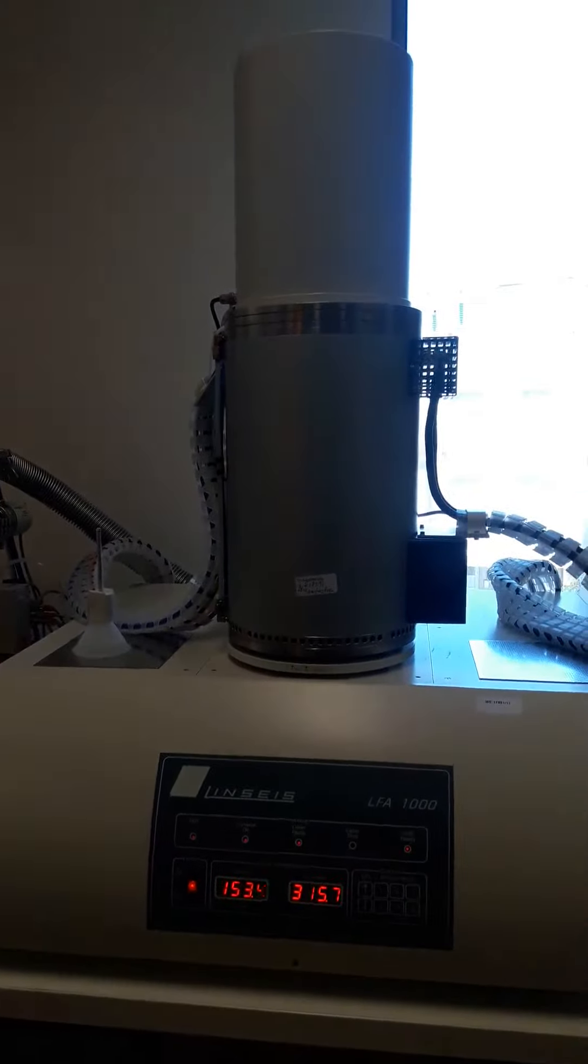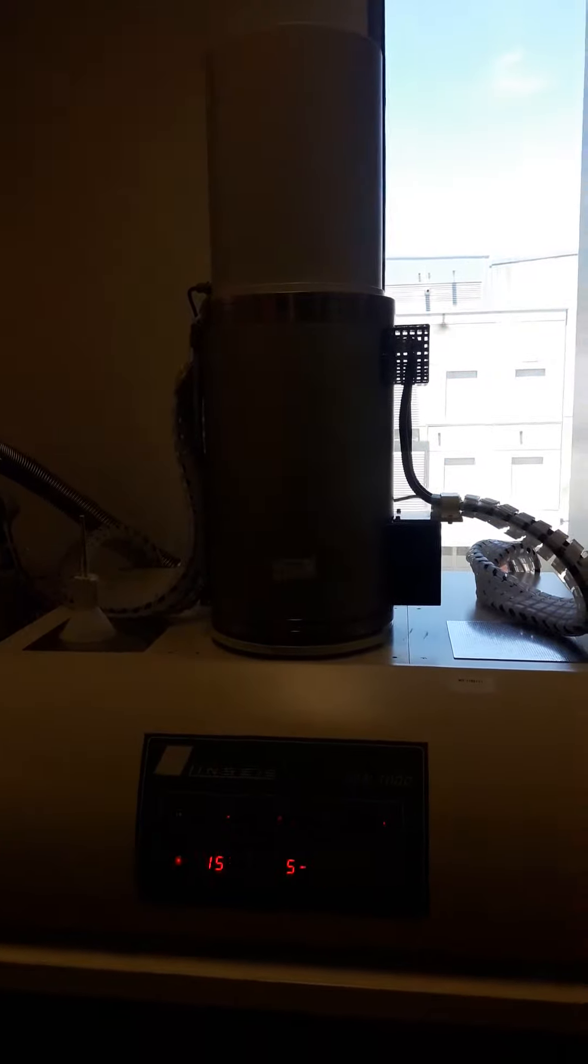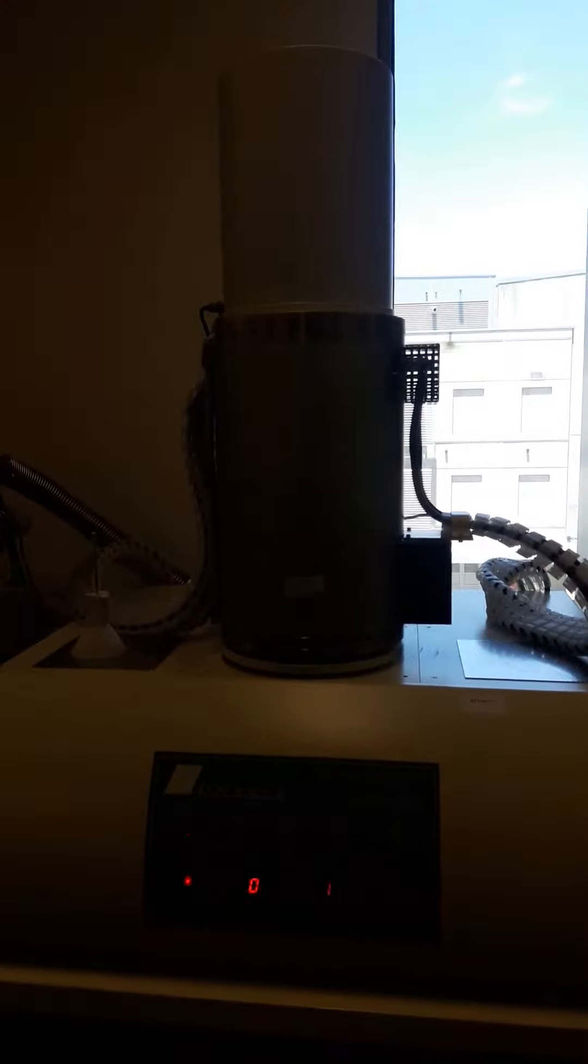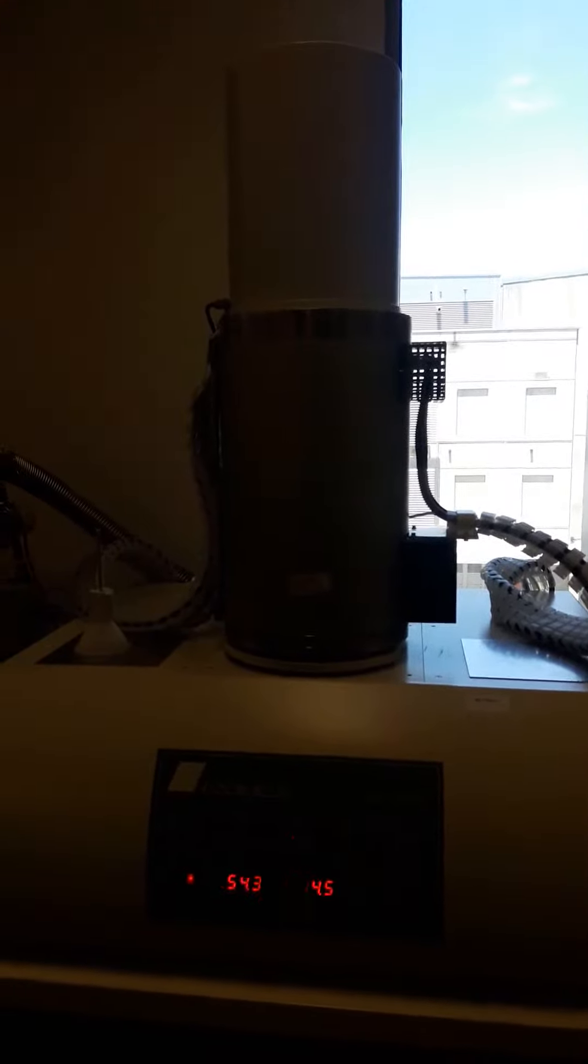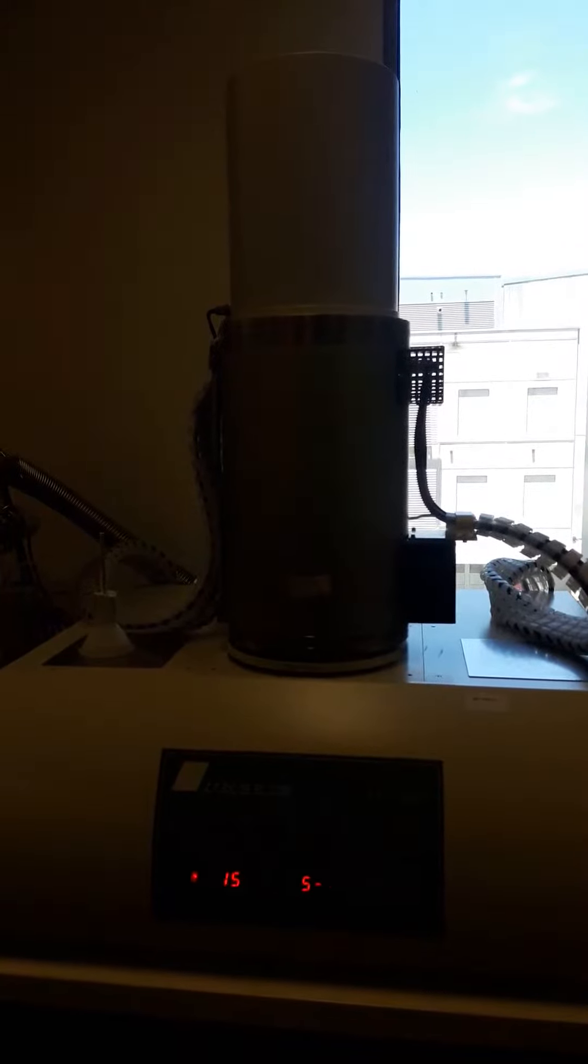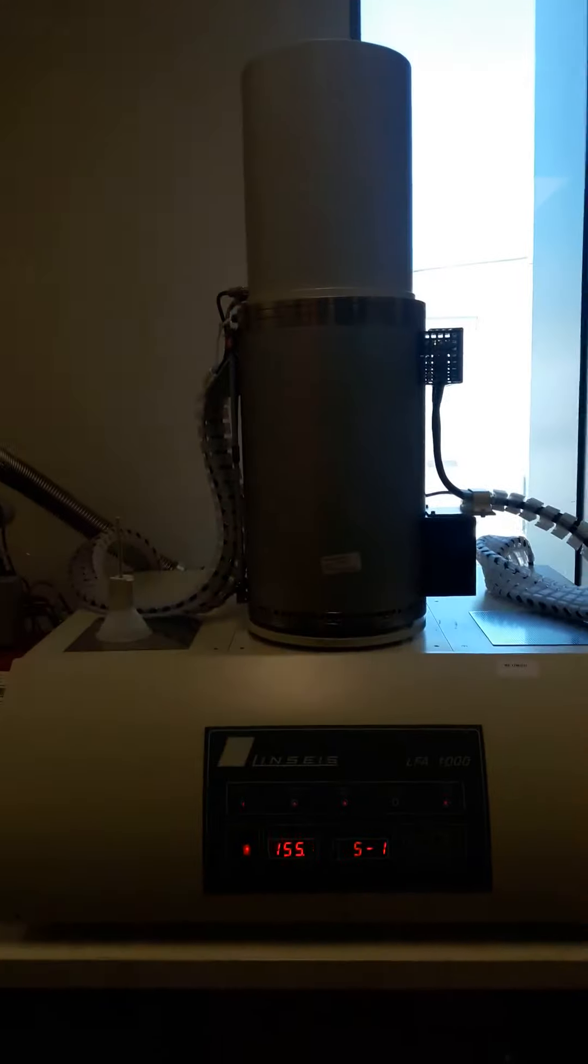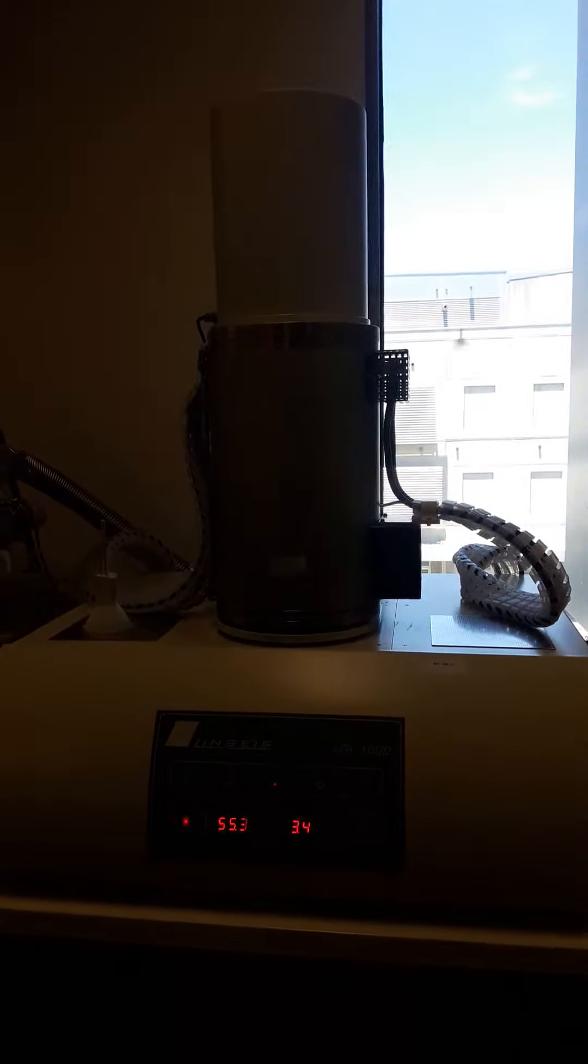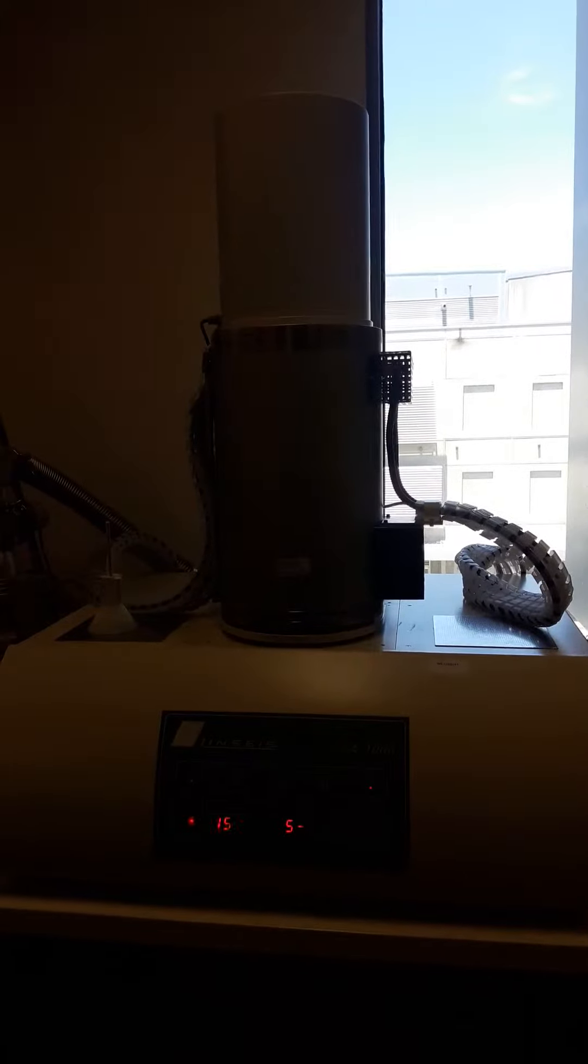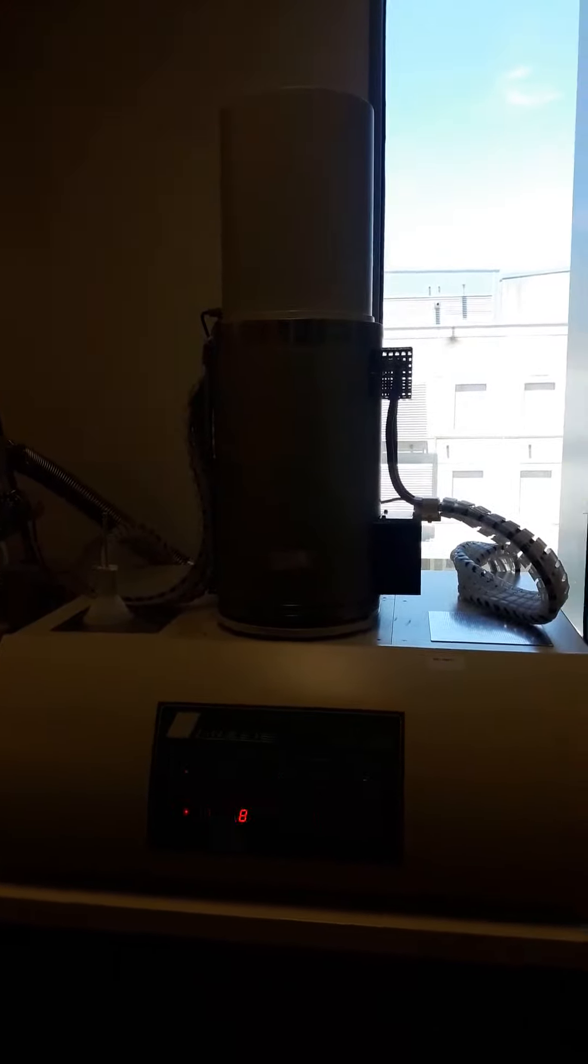Hello everyone, today I am going to show you another machine. This is called LFA, Laser Flash Analysis machine, to measure thermal diffusivity of a sample. Thermal diffusivity means how fast or how slow heat can flow through your sample.